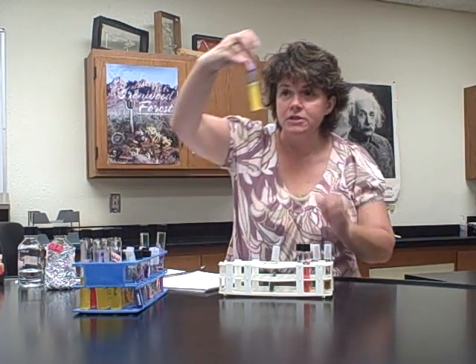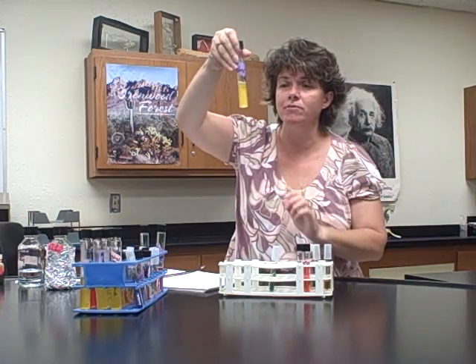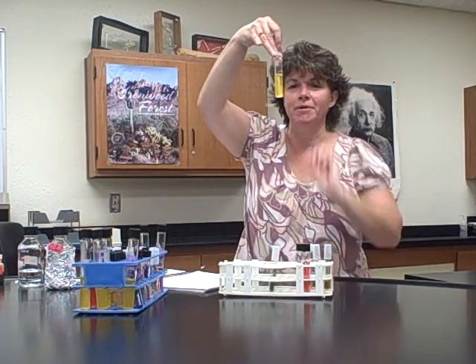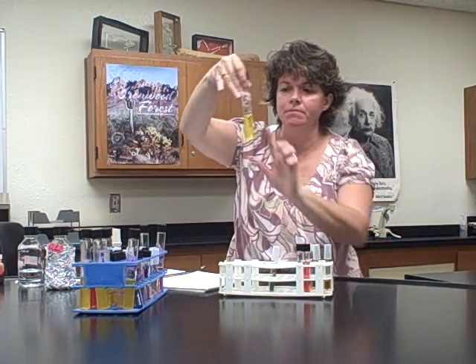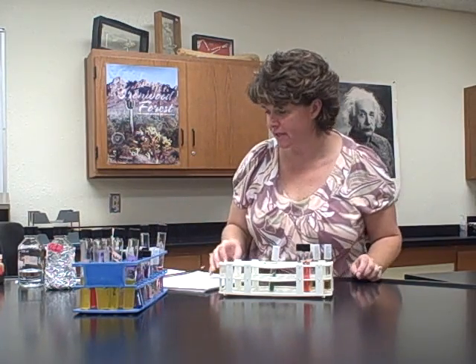This one right here, it's hard to tell. There's a little gas bubble in the top. So if I was this person, I would go and look at my notes and see if there was gas to begin with. But I can definitely see a gas bubble there. This one right here has a huge gas bubble. Okay, it's about that big. So this one is definitely positive for gas as well as acid. You may have some that produce gas but not acid, so you'll just have to take a look at those.